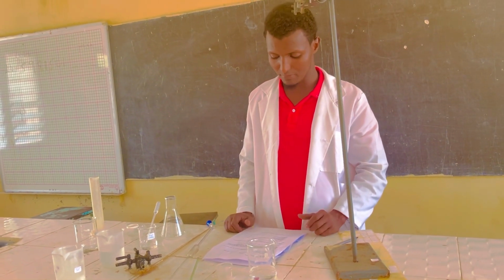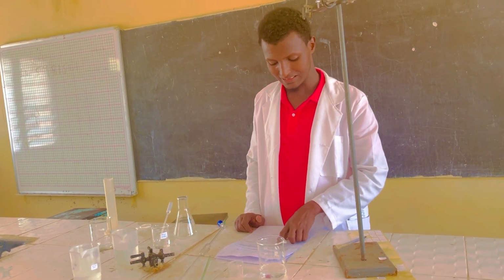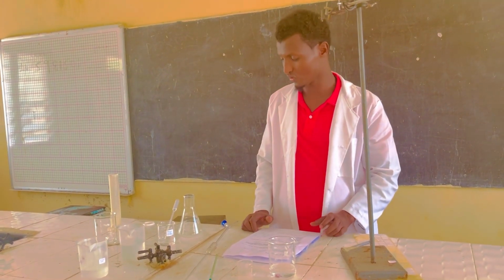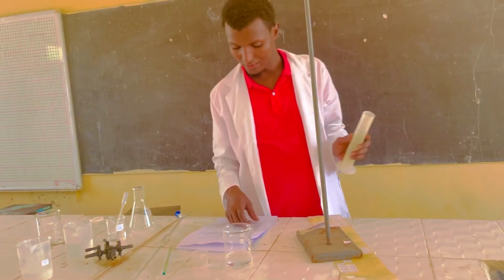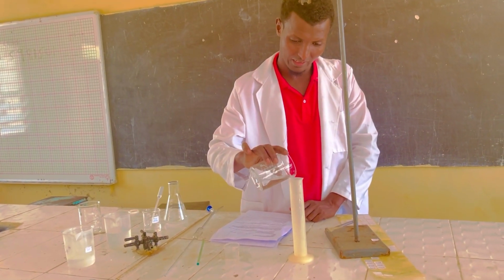Now transfer the mixture into a clean 100 ml measuring cylinder and add distilled water to make 100 cm³ of the solution.